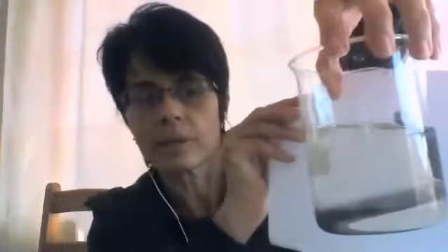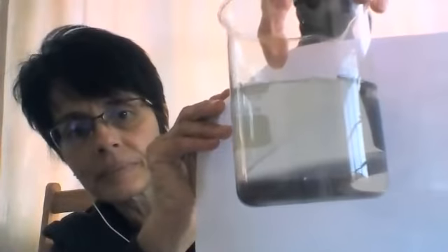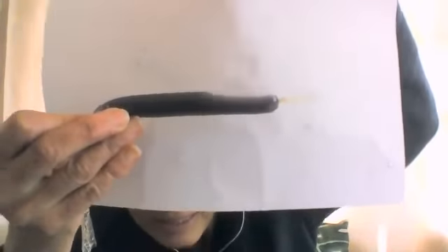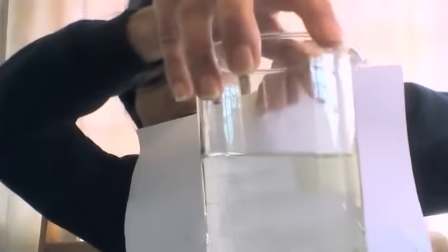Look what's happened now — you can see that it's almost clear. I take the little bag out, shake it up, and you can still see that it's a bit cloudy. Look at the color — hold the beaker up — almost clear, with just a slight yellow tinge.